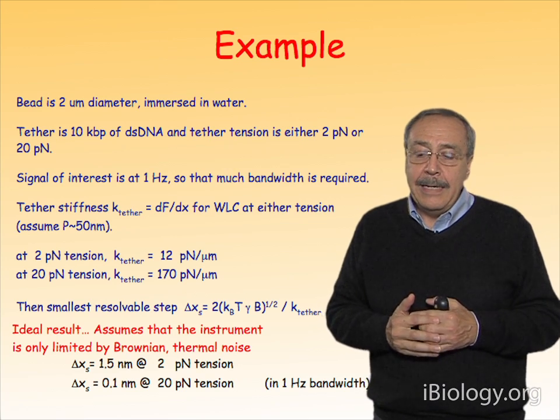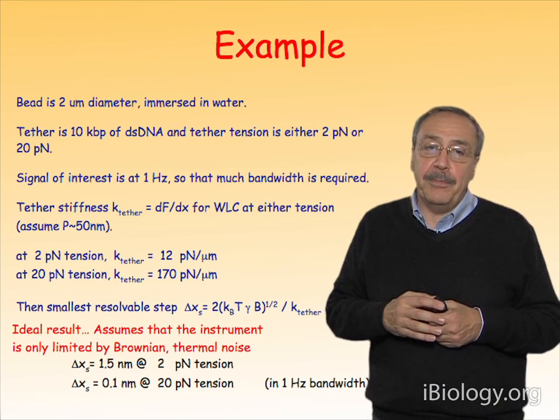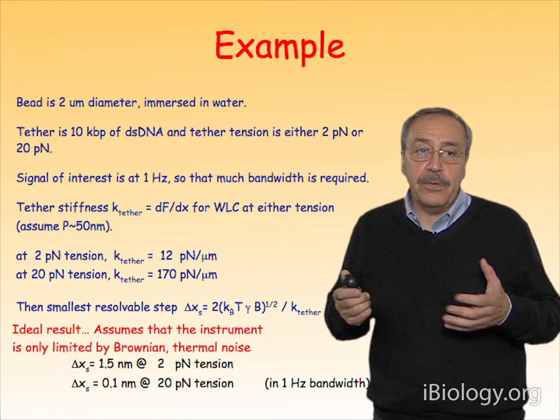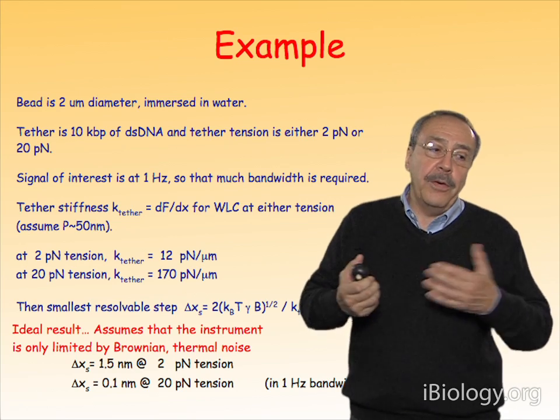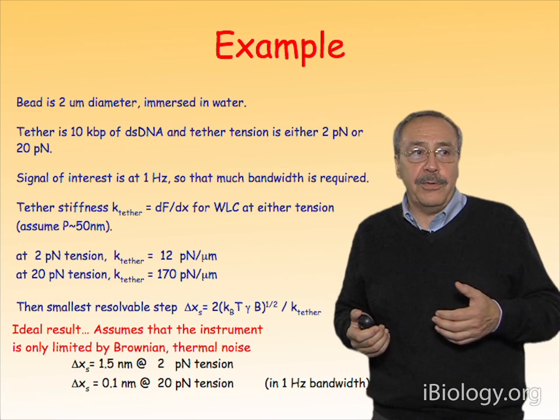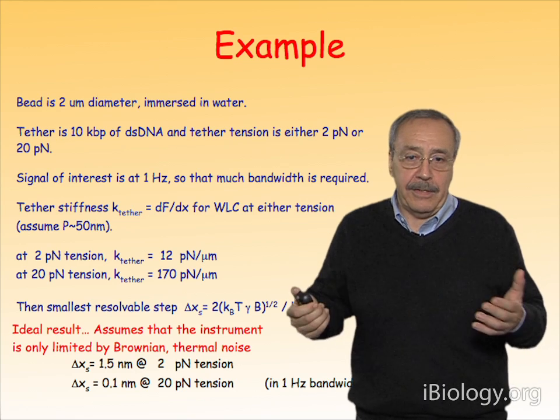As much as possible, wonderful things can be learned as long as you have instruments that are only limited by Brownian noise, and that's one of the big efforts in this field: to have instruments that are only Brownian limited and not limited by other problems like, for example, drift or temperature gradients in the laboratory, or mechanical noise due to the building, vibrations, or acoustic noise, etc.